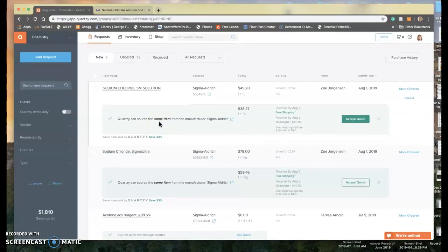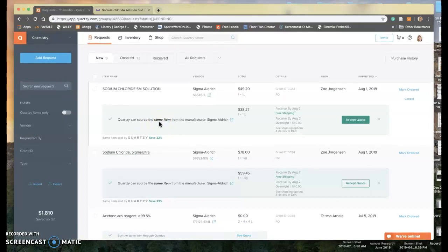If you ever have any questions or are not quite sure how to request an item, you can always ask someone who's worked in the stockrooms before. You can ask Teresa, or if you really need to, you can ask a faculty member.